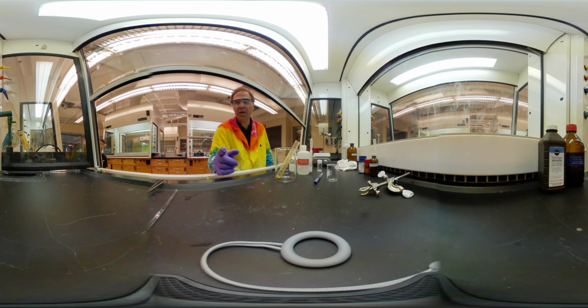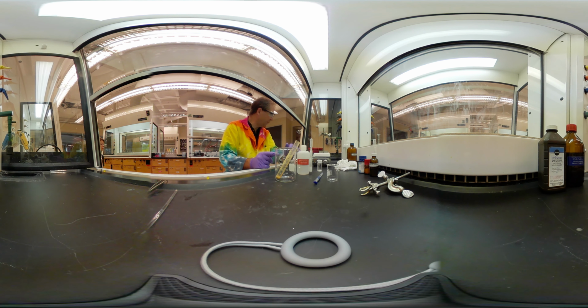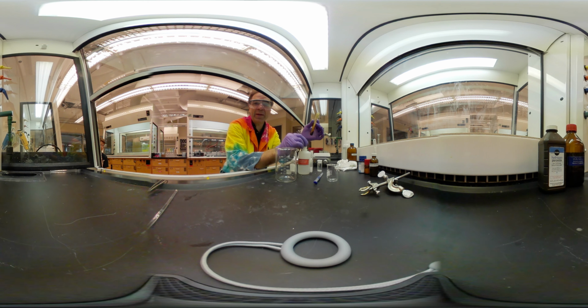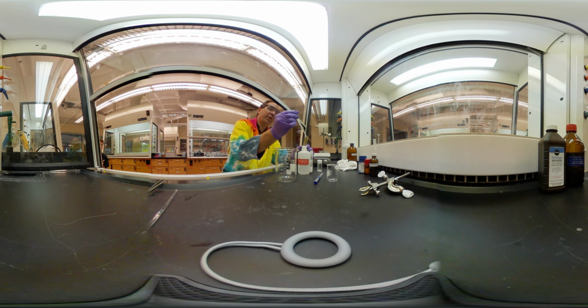Interestingly, bases can cause burns just like acids, but they're actually worse burns because your body doesn't realize it's been burned, so it doesn't try to heal it. So you have to be really careful with that. All right, we're going to add 5 milliliters. Again, approximate amount, so this pipette will be good enough. There's 2.5 milliliters. Whoa, that's not what you're supposed to do. Good catch. Okay. The other thing about sodium hydroxide, it's slippery. We almost had to start the whole thing over again. Joys of chemistry.